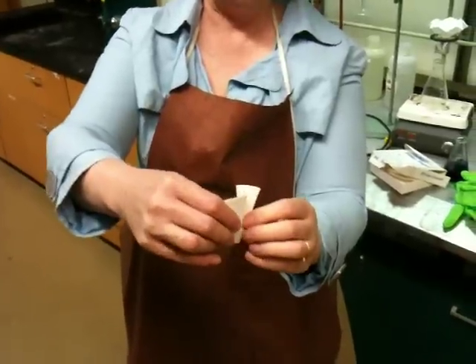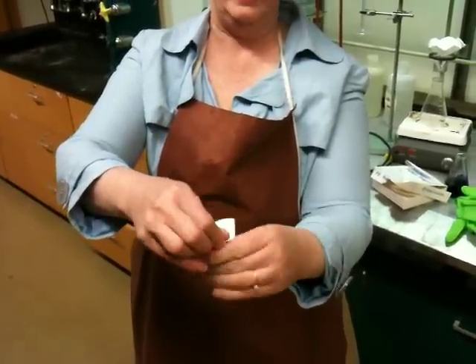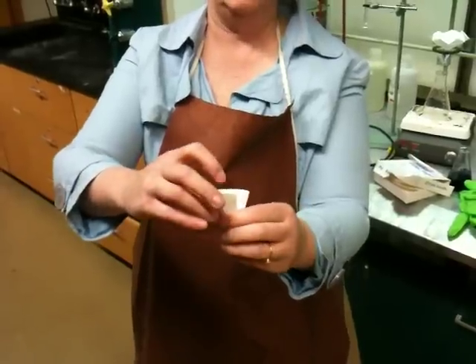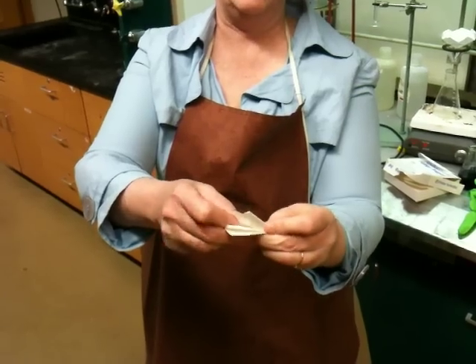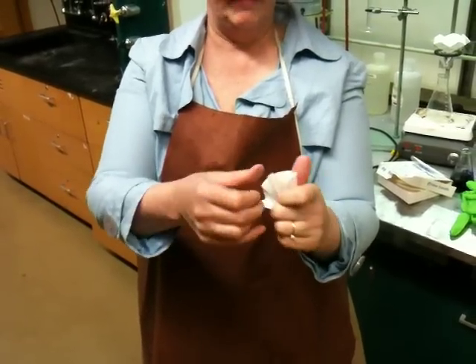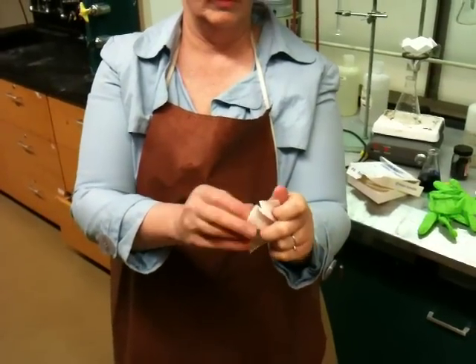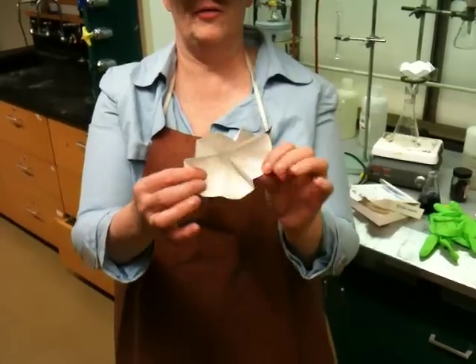So I'm folding it back now. Then go with the fold you already have. Then fold back again. You see how I'm making a fan? Then fold with the fold you already made. Then fold back again. And then fold back again on the last crease. Then when you open it up, you have nice, even creases in your filter paper.